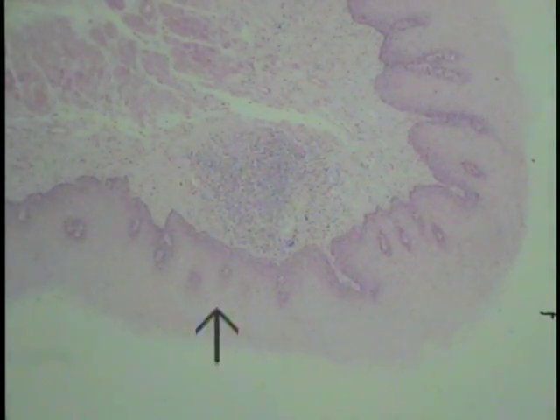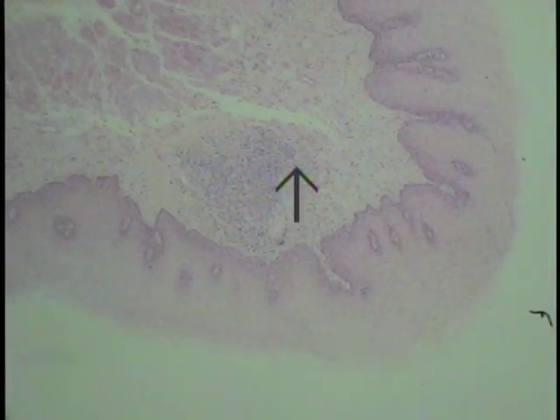This is the plastic embedded section of a cross-sectional profile of the esophagus as seen with the scanning objective once again. The lumen, as in the entire length of the esophagus, is lined by a stratified squamous type of epithelium of the non-keratinized wet variety. It is very thick in its overall dimensions, and as mentioned before, very similar in depth to the epithelium observed in the oral cavity. Also shown is a small lymphatic nodule within the lamina propria, which is shown here.